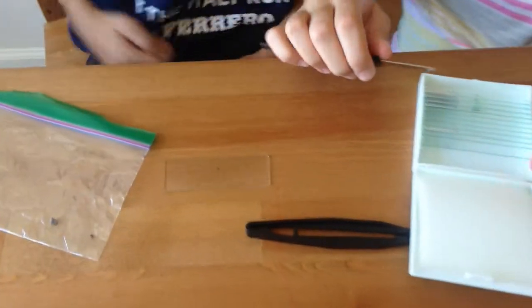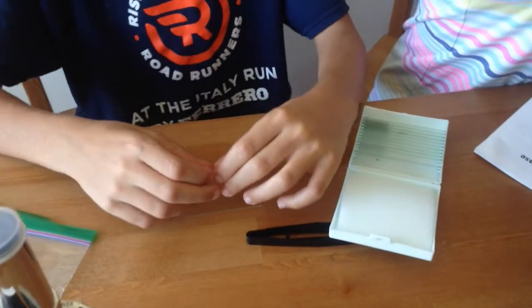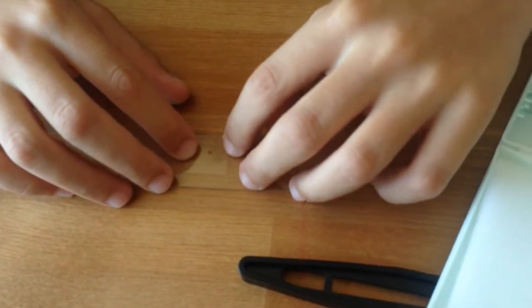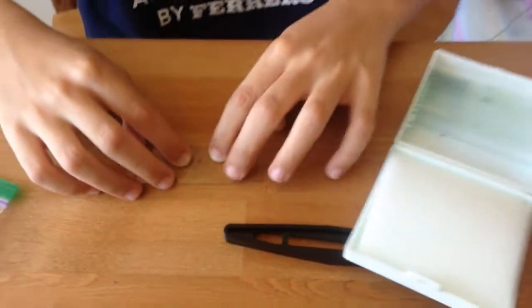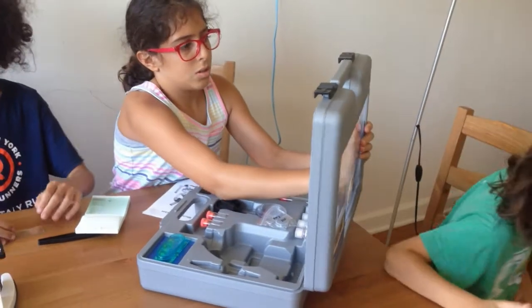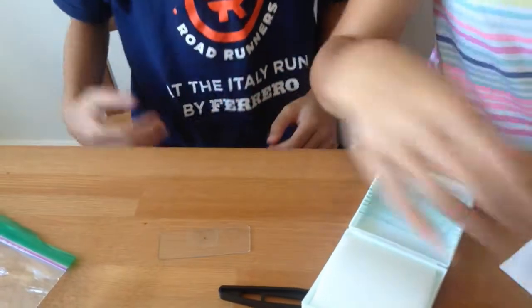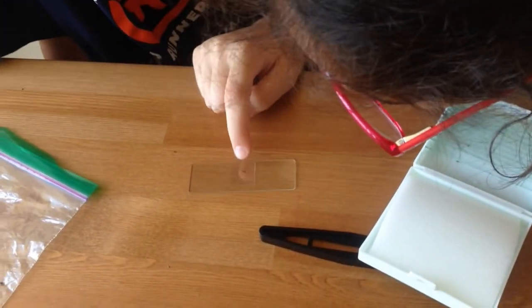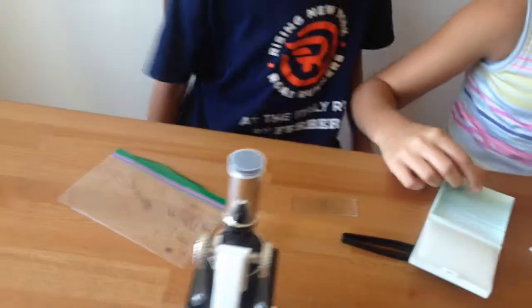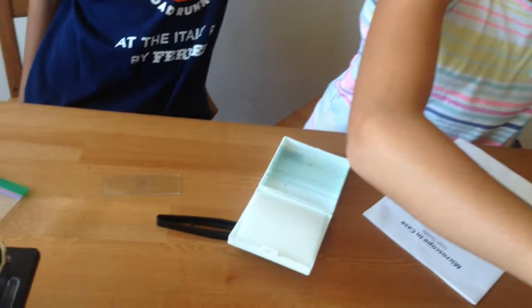I'll just remove this. Our microscope box is destroyed, so I don't know how we do this — I don't know how I'm going to stick this. So there we go, we have it, we just did it. Now, how do you keep it there? You need to glue it or something? Just put it under the microscope.